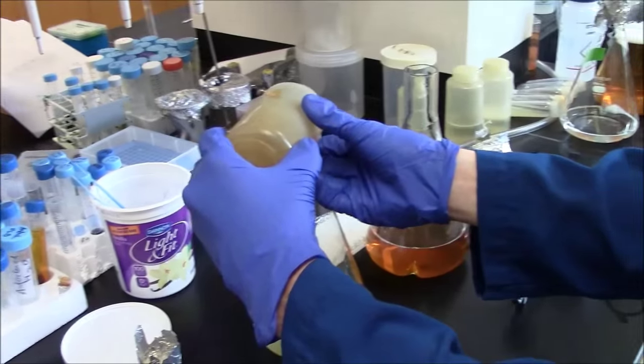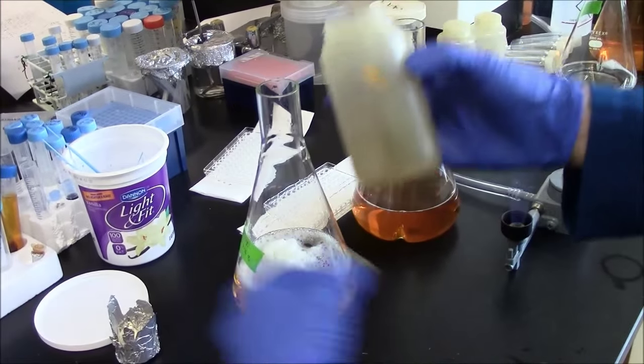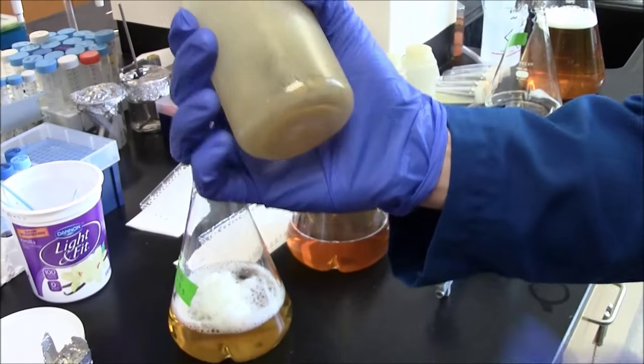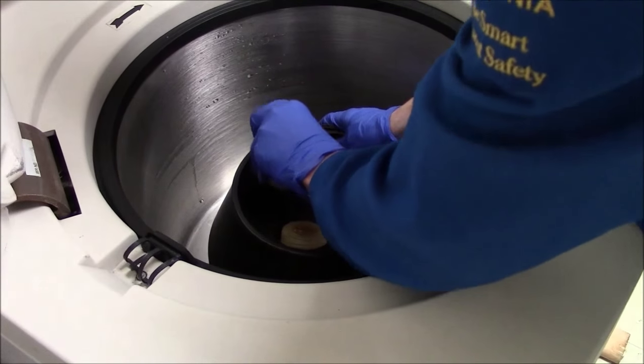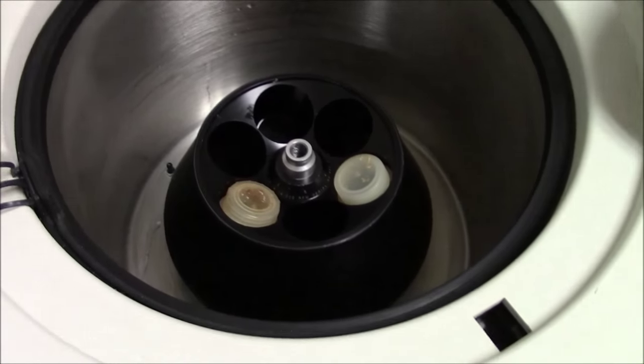So, there's the supernatant. Keep the pellet this time. Now the pellet is the valuable part. Okay, so you're putting it back. These will go into the centrifuge in the same original orientation, so the pellet's on the outside, where it was formed originally.